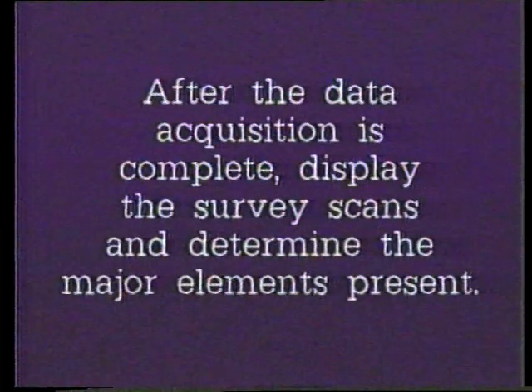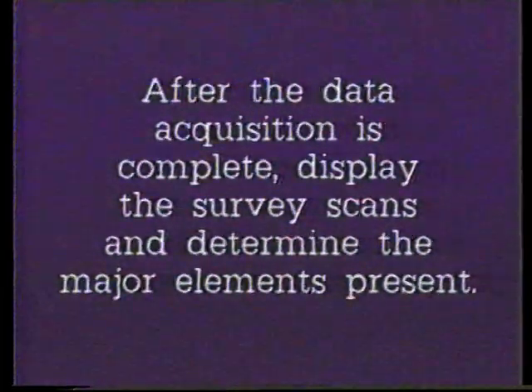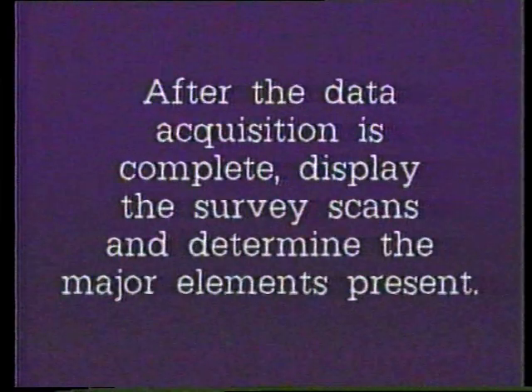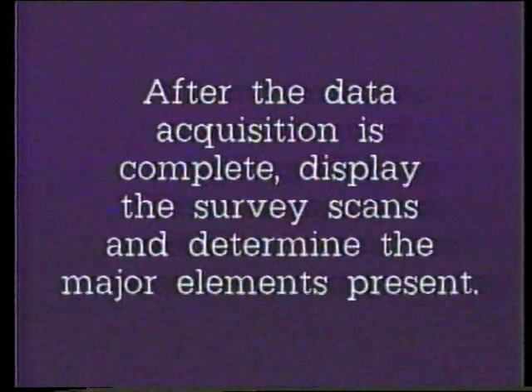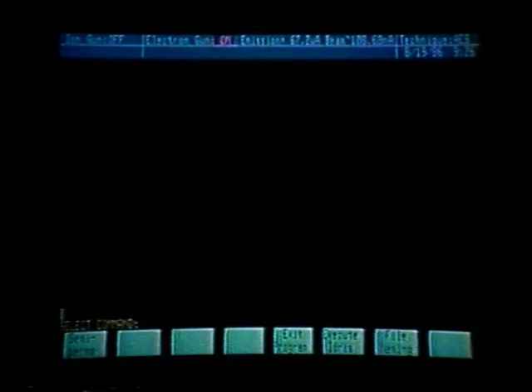When the acquisition is complete, we notice two things on the TV: we no longer see an indication of any of the areas — area 1, 2, or 3 — and on the terminal we see that we have returned to the home bank. Now that data acquisition is complete, we need to display those survey scans and determine what major elements are present on areas 1, 2, and 3. To do that, we can use function key number 16, which will display our last acquisition — our survey scans.